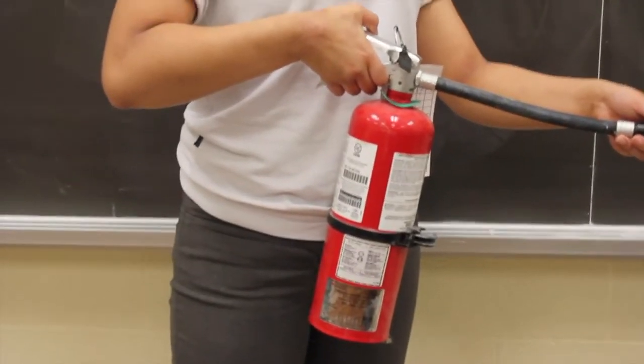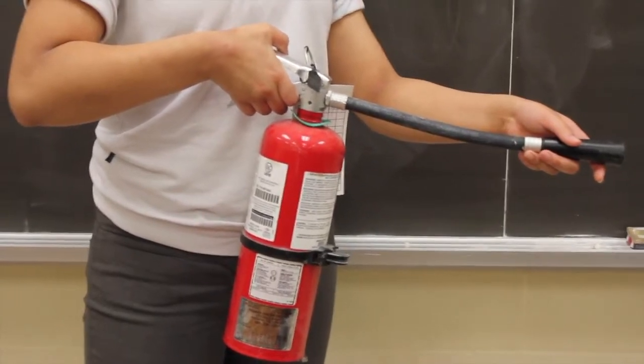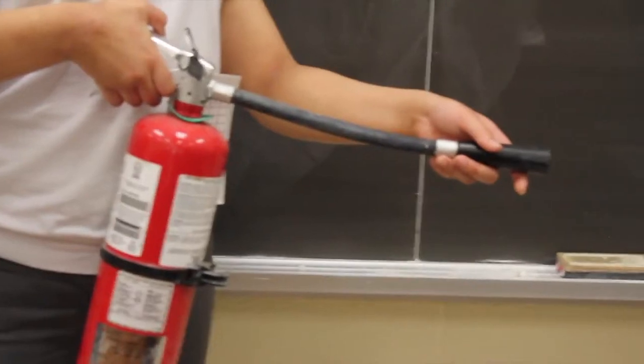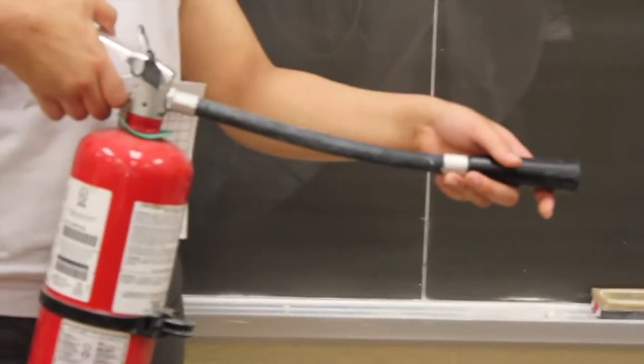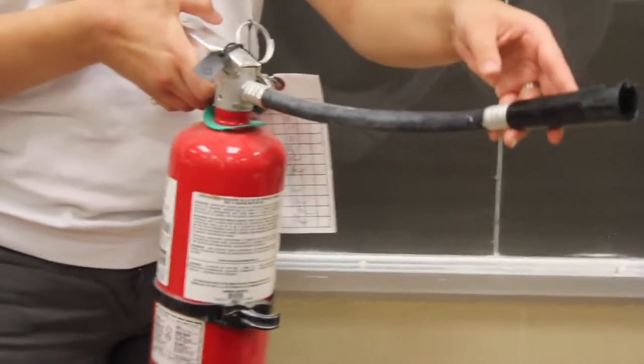When using a Bunsen burner, if a fire occurs in a small beaker or container, the best solution is to cover the container and to turn off the gas to ensure that the fire will not be able to reignite. However, if a large fire occurs, it should be dealt with by a fire extinguisher, which should be used only by the teacher.